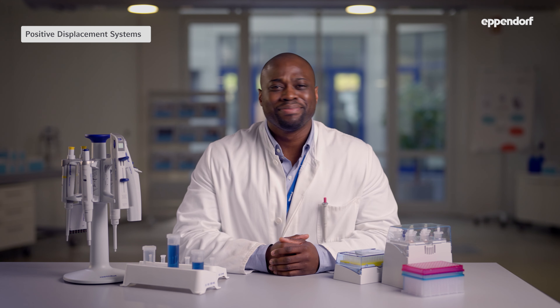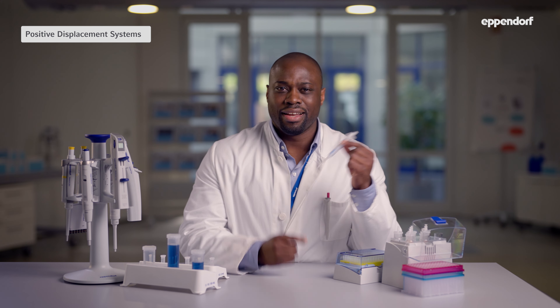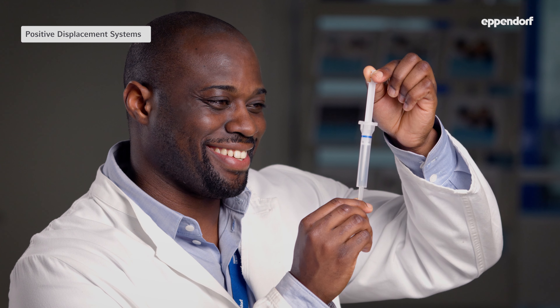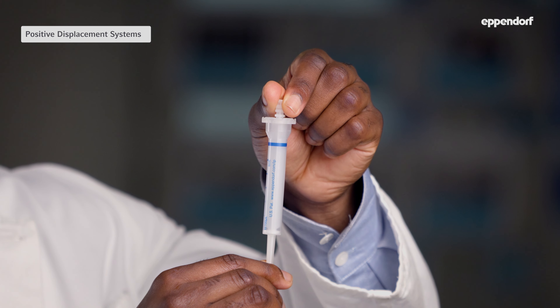In contrast, positive displacement systems work without air in the system. Let's take a look at the Multipette Combi tip system. As you can see here, the piston sits inside the tip and is in direct contact with the liquid. Pulling up the piston creates a vacuum that causes the liquid to flow into the tip, and pushing it down causes the liquid to flow back out.